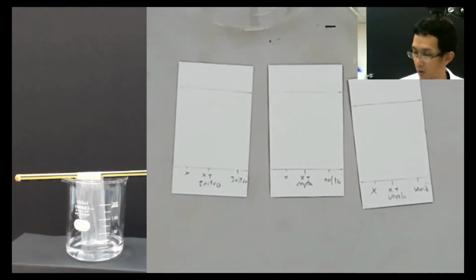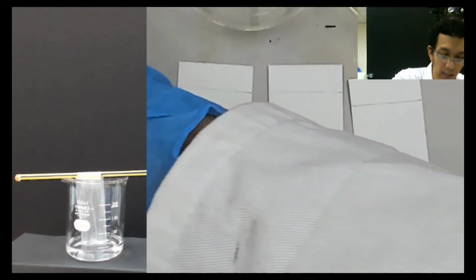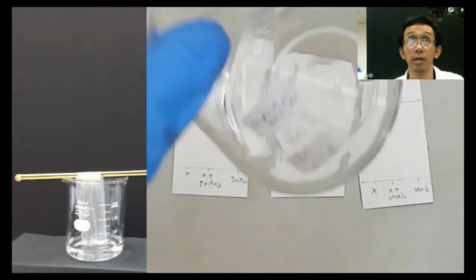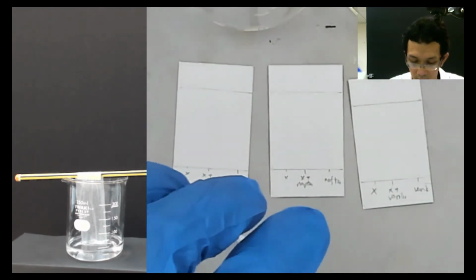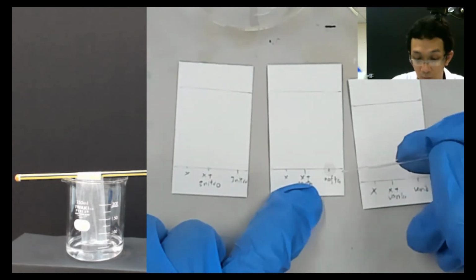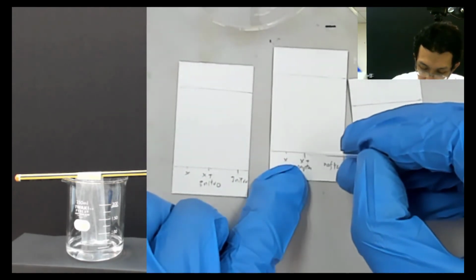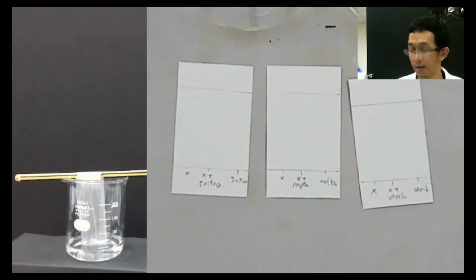So we're done with this. Now we take a new spotter, prepared before. We're done with this, and then we use naphthalene for the second one. So same thing. It's not really difficult. Just put here. Oh, that's too big, but it's okay. And then I want to put in the middle. Okay, that's okay. So it's already combined there. Now done with that.